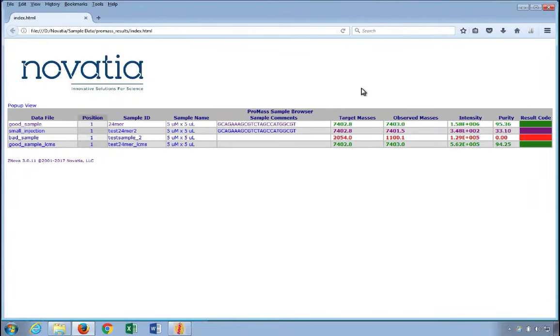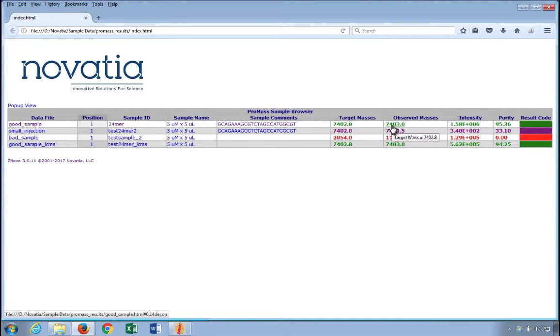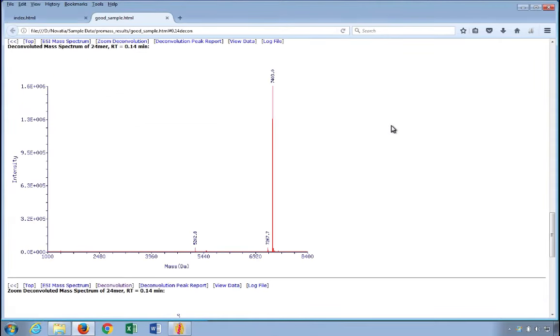However, clicking on either of the target or observed masses will jump you right to the deconvoluted spectrum showing that mass.